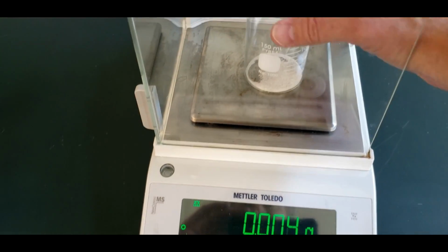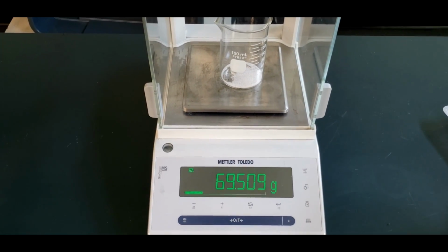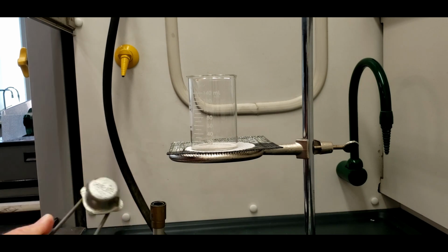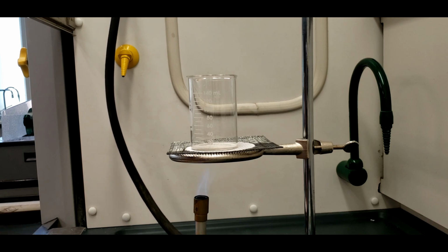Okay, we'll put this in here. See what we have for the mass of the beaker and the residue after the first heating. So we're going to try another 5 minutes. And if I see any of the residue form on the beaker, I'll flame throw it off. Otherwise, we'll just let it go for 5 minutes and then cool it and then weigh it again.